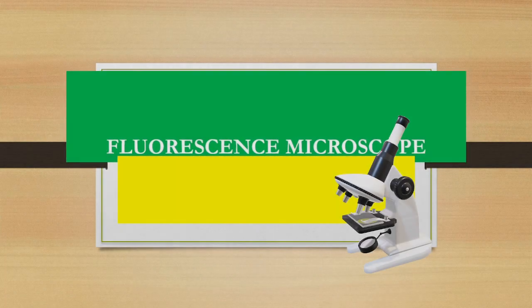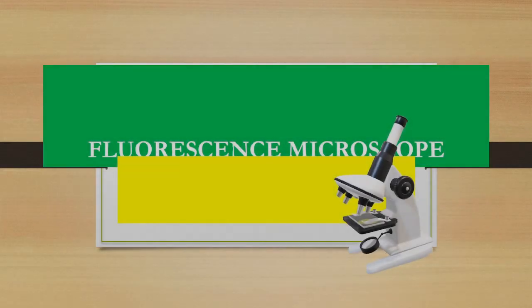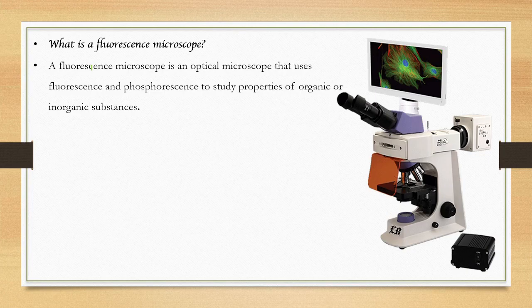Fluorescent microscope. What is the definition of fluorescence microscope? It's an optical microscope that uses fluorescence and phosphorescence to study the properties of organic and inorganic substances. We'll see later what fluorescence and phosphorescence are.